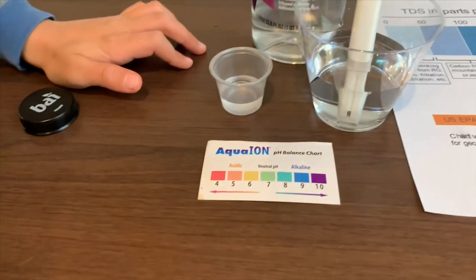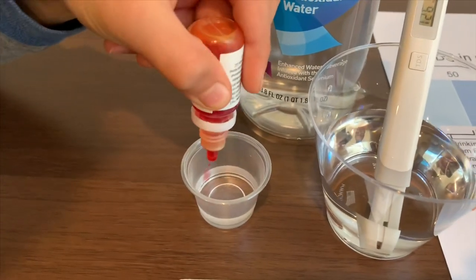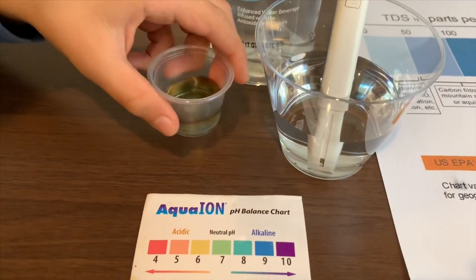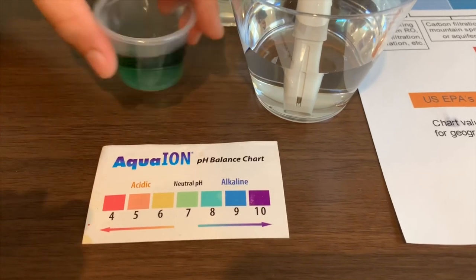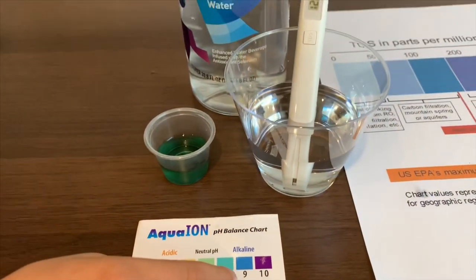Now, let's test the pH level. Let me do two drops. I give this an 8.5. That means it's alkaline water.